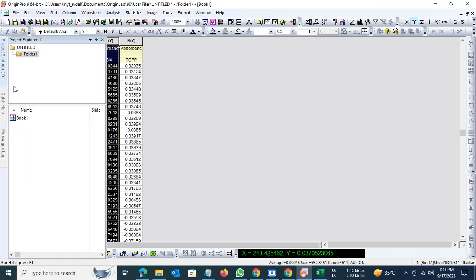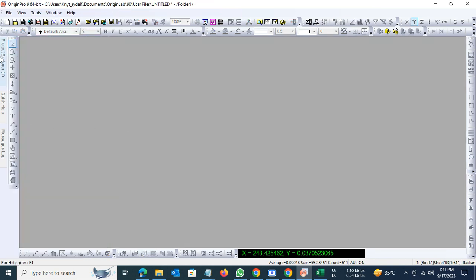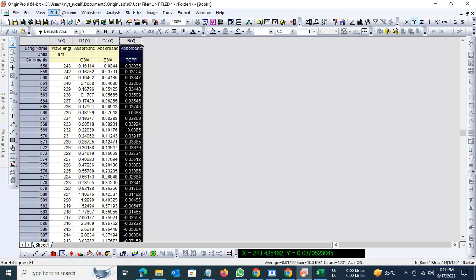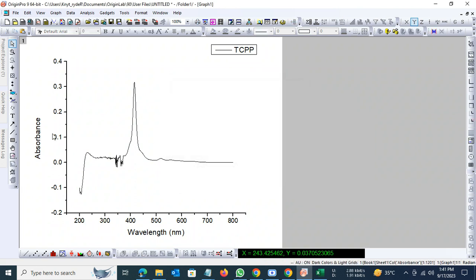So let me check it for all the samples. Okay, so that's approximately 240.